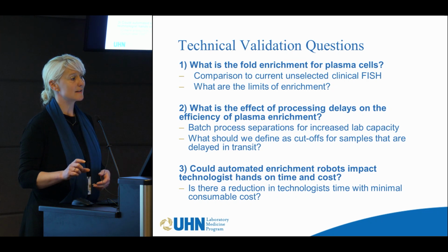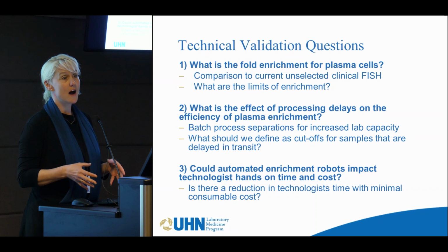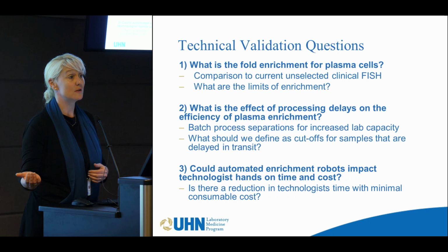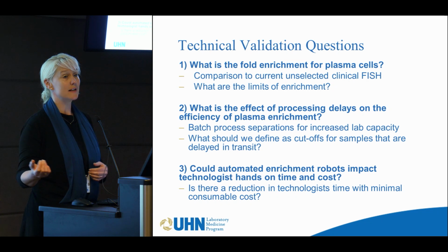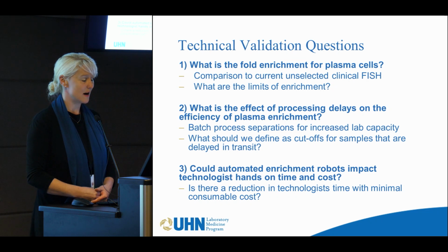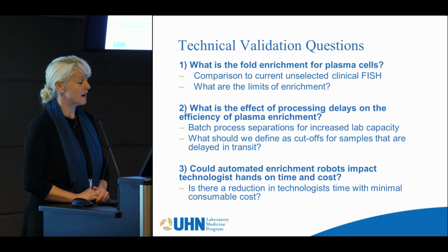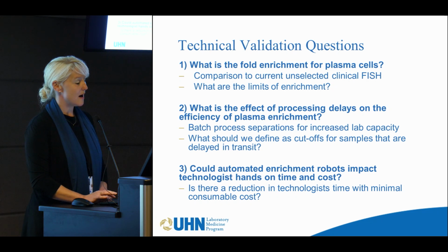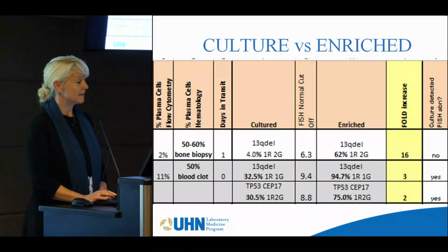So we tested same day magnetic cell separation versus up to 72 hours later. And again, that was great working with their team in order to complete this. So batch processing we found was very valuable in addition to the robotics.